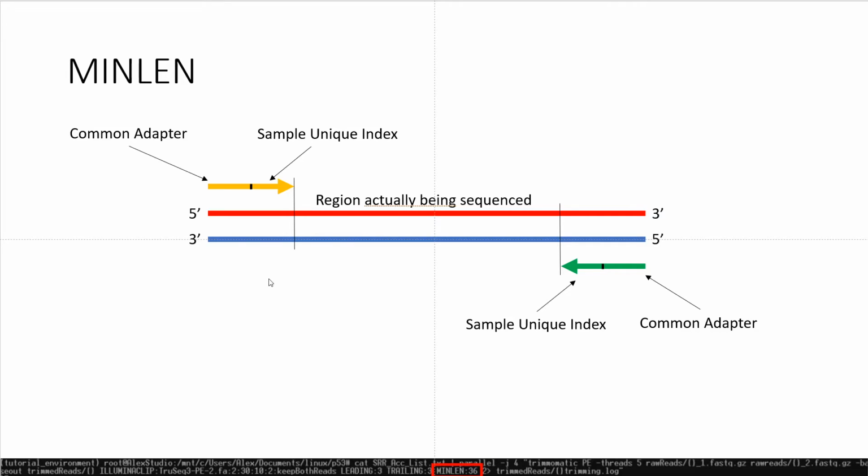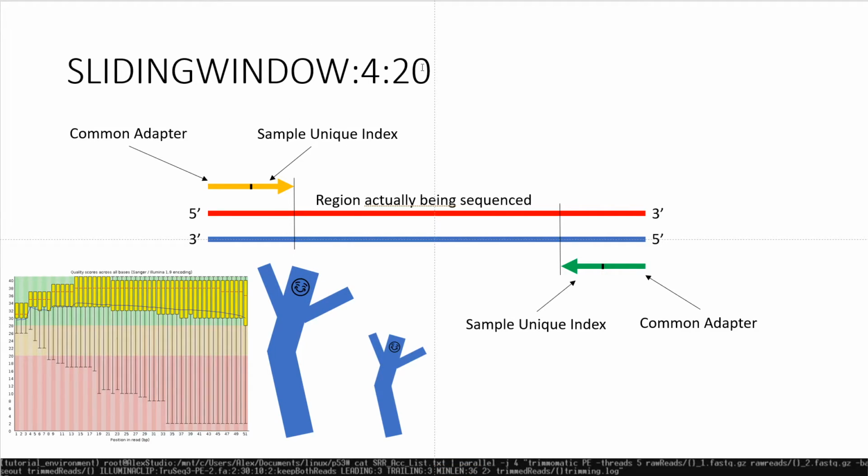And that really comes into play when we look at something like this, a sliding window. We have really good reads, so it's not too big of an issue, but when we start getting longer and we have a really hard tank at the end of our quality, we're going to say in a sliding window of 4 base pairs, so from 1 to 4, if that average quality drops below 20, just cut it off. So for instance, here's below 20, here's below 20, below 20, below 20.